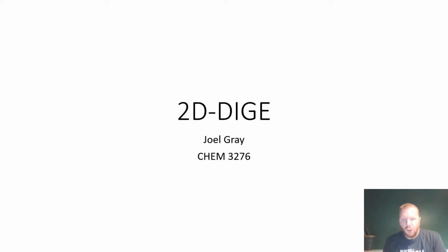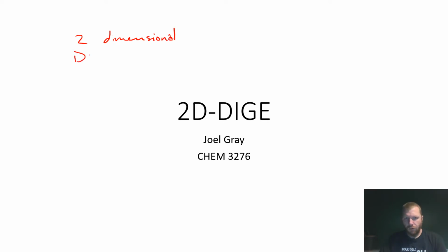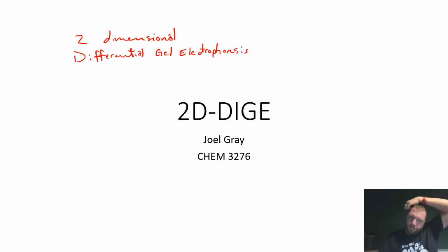2D DIGE. Okay, what does this stand for? This stands for two-dimensional differential gel electrophoresis. All right, so 2D differential gel electrophoresis.